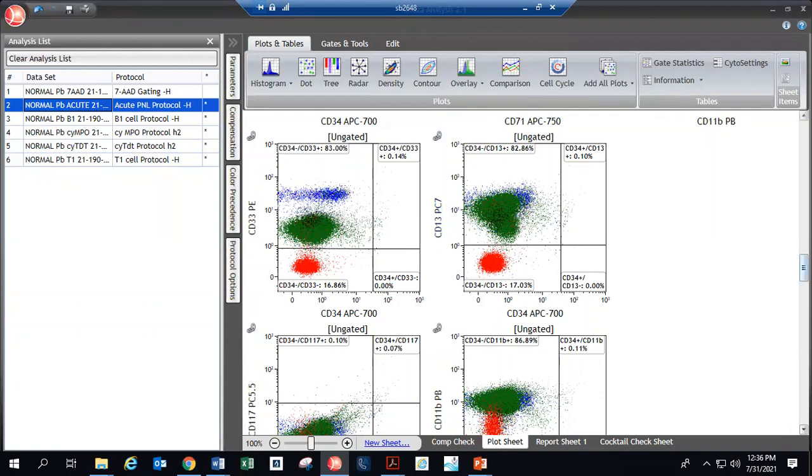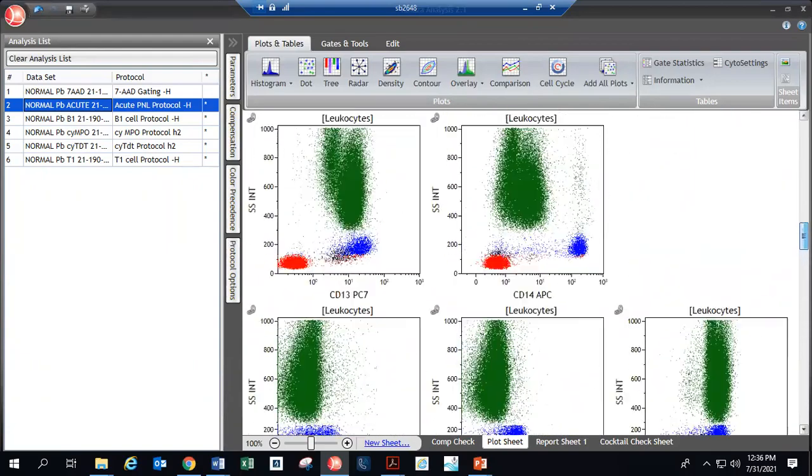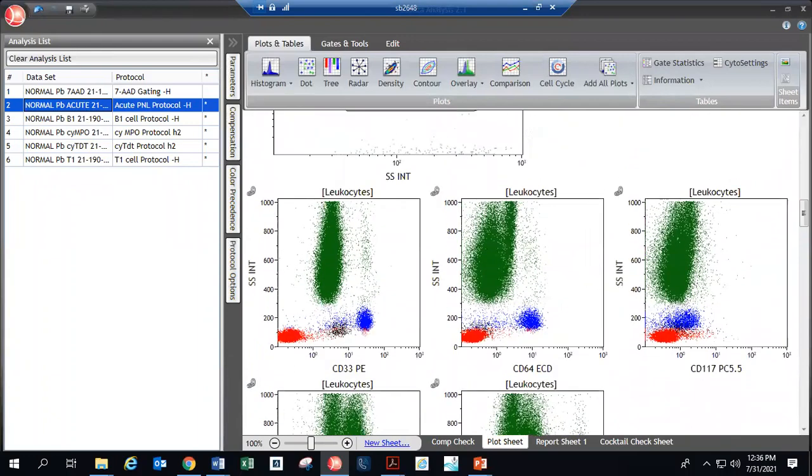So that's that. Hey, Akanksha, can you move two-three plots above, back? This one, stop at this one. Maybe this one too. The second plot, the granulocytes: if you see in side scatter versus CD33, the granulocytes are a very concise plot, but they look kind of spread. The green plot I'm talking about, in CD64 and side scatter, they look kind of spread out, and even in the plot below. That's not abnormal. Yeah, go ahead. So these are not abnormal.